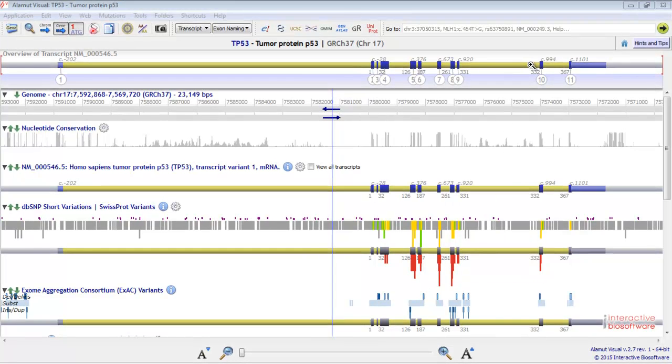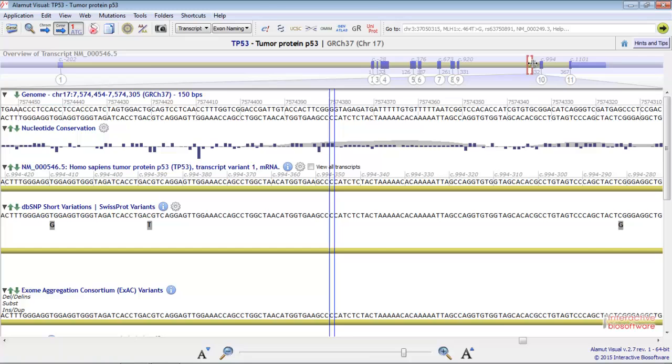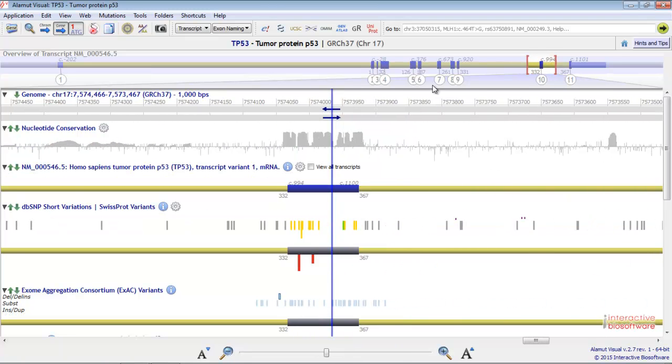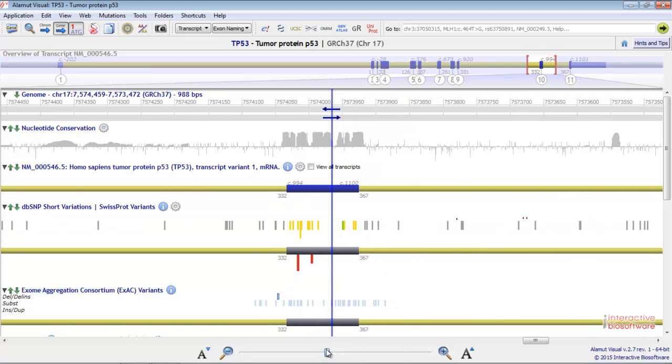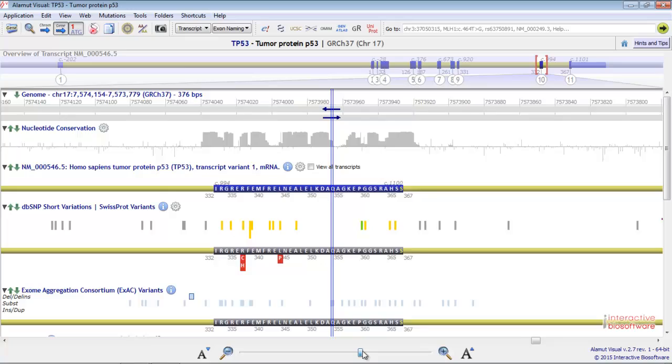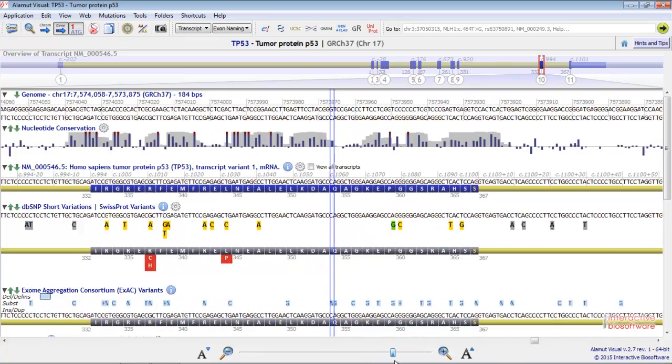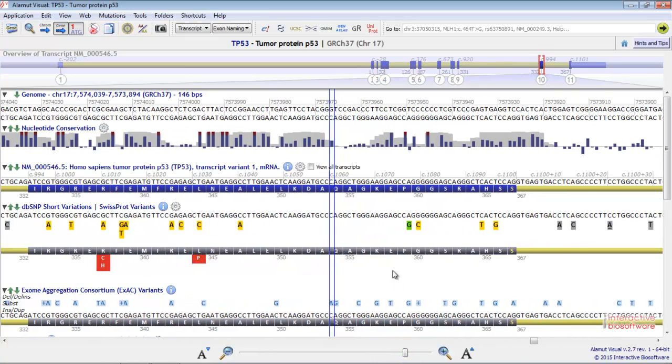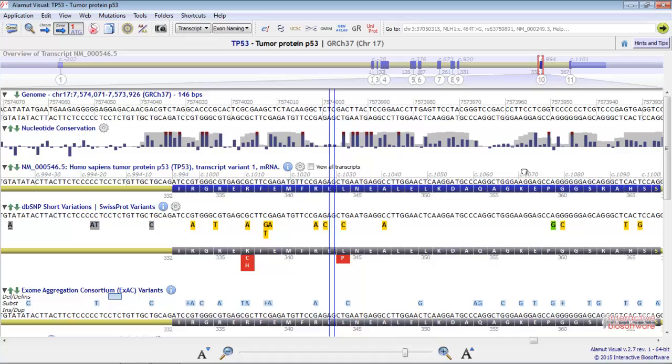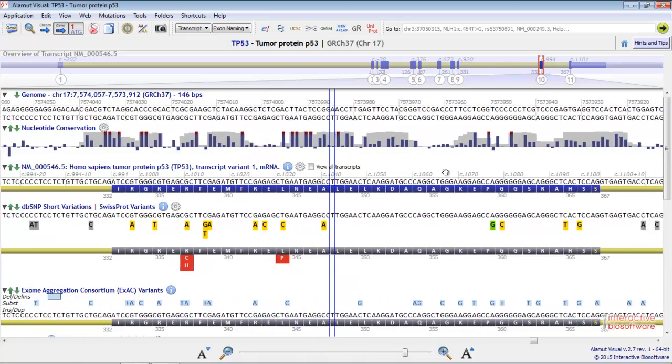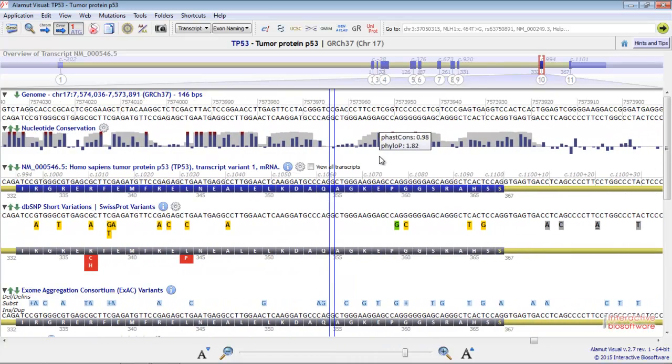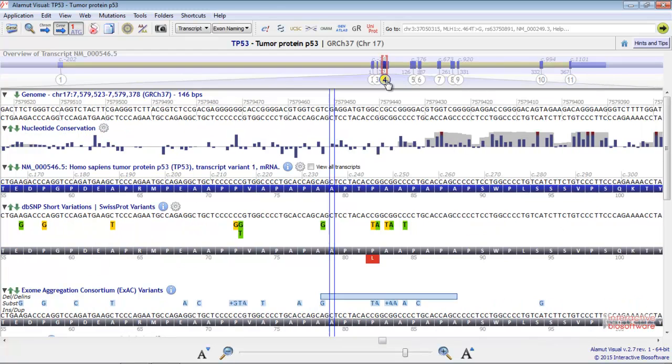You can select the part you want to have a look at like this and then zoom in. You can navigate around the locus, or you can directly click on the exon number you want to work on.